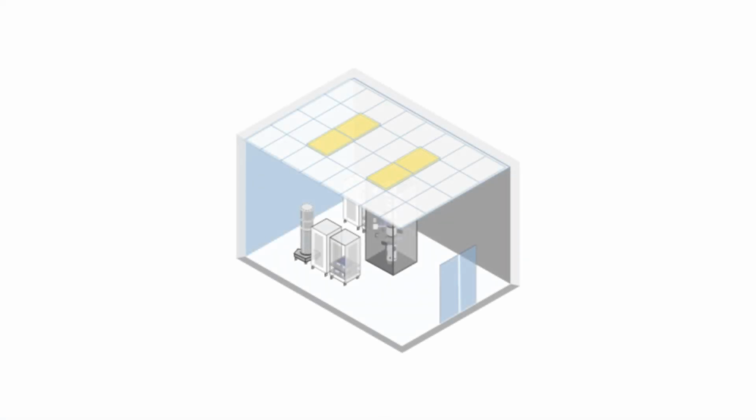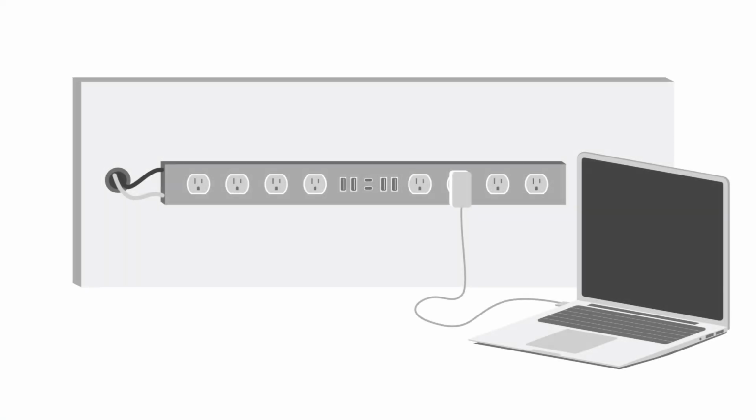We hear customers over-index on this because of the historical experience with magnetic ballast lighting. But if you use modern LED lights, this typically isn't an issue. The third really common source of magnetic fields we see inside a lab is the raceways and power strips that you see run around labs. These are often over workbenches, so users can plug in their laptops or electrical equipment or instruments they need to do their experiments. These raceways and power strips are very problematic, particularly the cheaper ones.